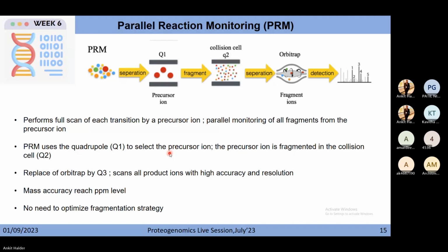But here you are analyzing all those fragments at a go. That's why there is no need to optimize the fragmentation strategy. Okay.